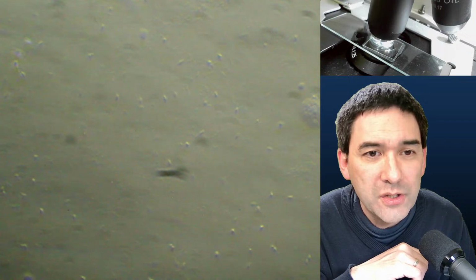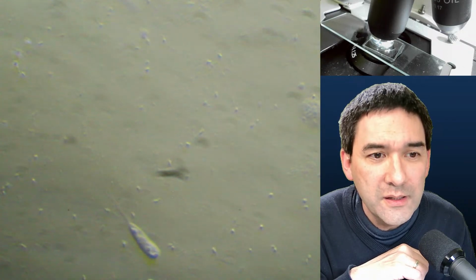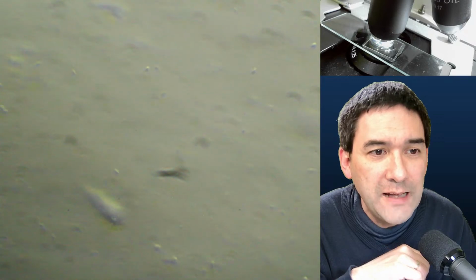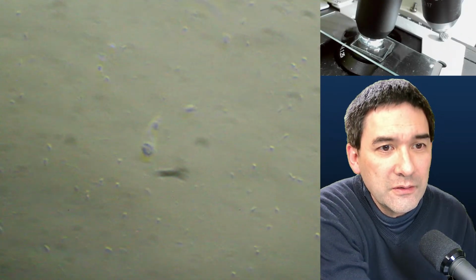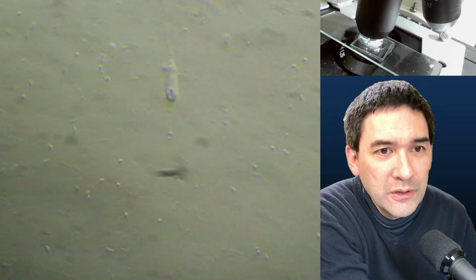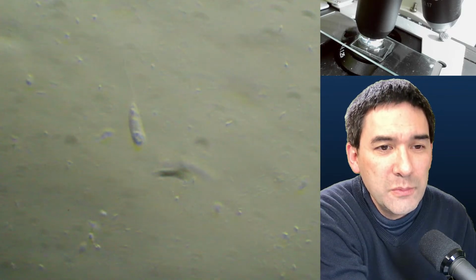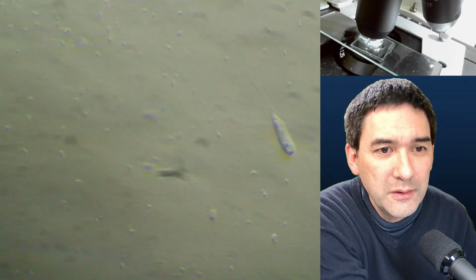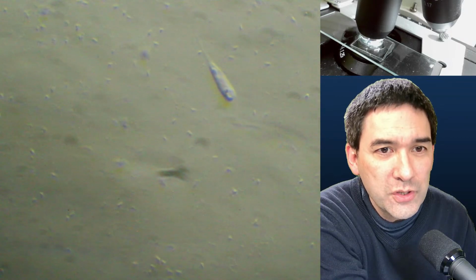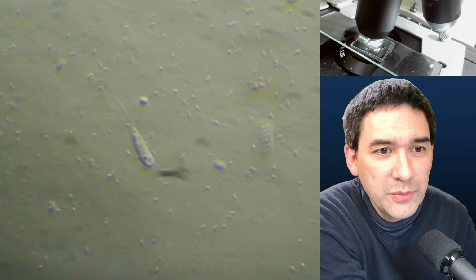Oh, look at this. This is not a ciliate, it's a flagellate, because it has this one flagellum in front. That's a eukaryote. It's also quite nice. But there seems to be some dirt in the optical system here. This black thing in the middle, we just ignore that. But here again, if you look at this one, you see that it's actually dark on one side and bright on the other side.